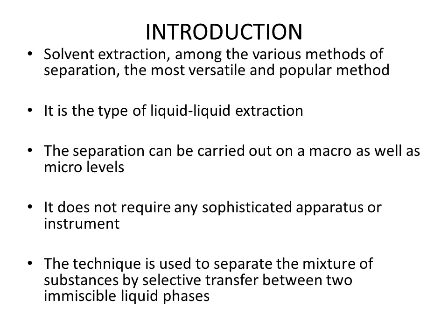So first of all, introduction. In laboratory, whenever we synthesize an organic compound, most of the time we get it in the form of a solution, and most of the time it is soluble in water. So generally we obtain our compound in pure form by evaporation, but sometimes our compound of interest is volatile or thermally unstable. So if we heat that solution, we may lose our chemical compound. So for that purpose we need solvent extraction.